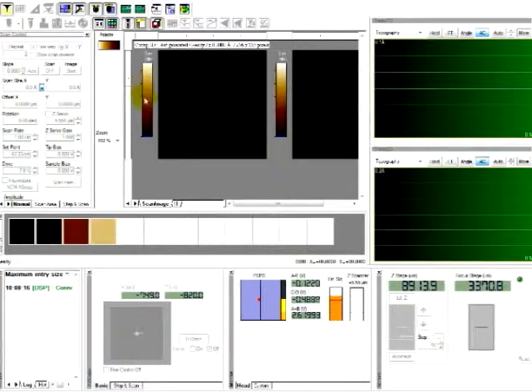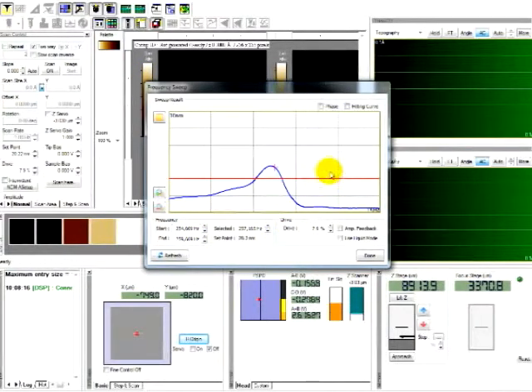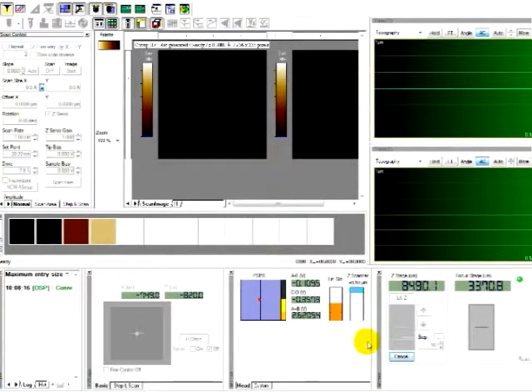And the NCM frequency sweep window will appear as soon as you change into non-contact mode. Then you can click done, and then you can approach to the sample. For non-contact mode, there are 3 major parameter settings that you need to do. First, scan rate, Z servo gain, and set point.